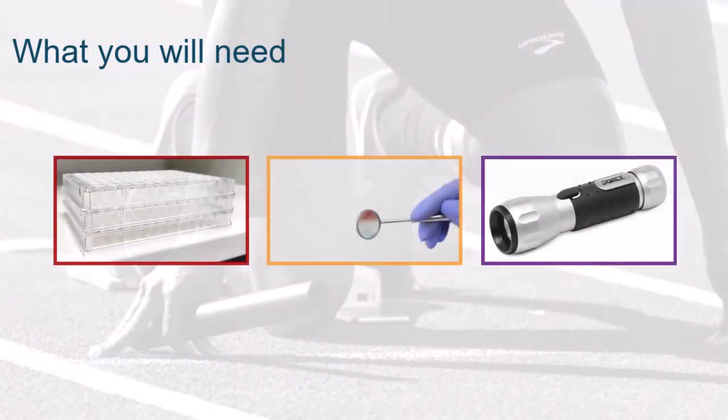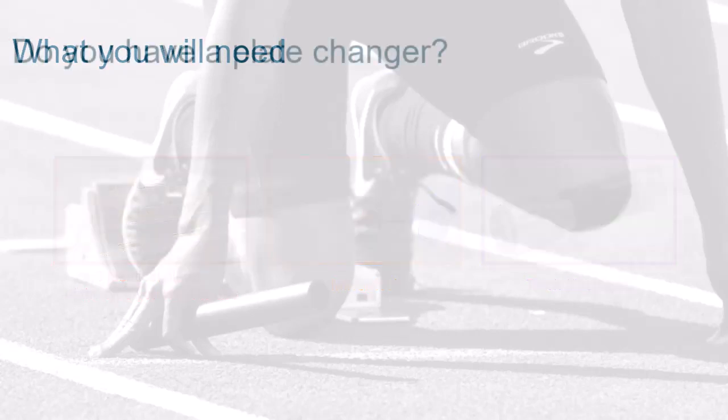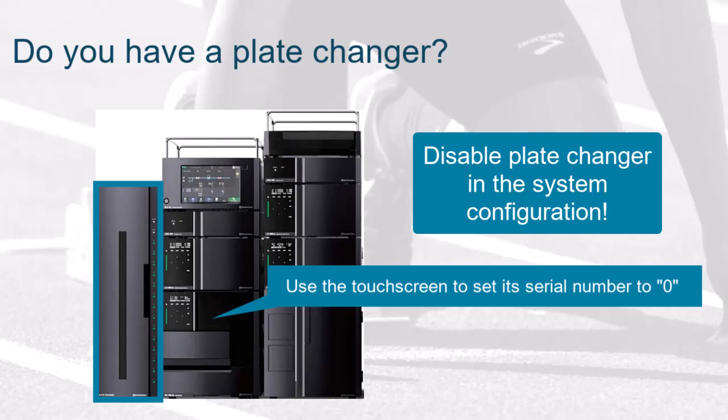Before starting the plate calibration procedure, make sure you have the following tools and items ready. You need to have three identical plates of the same type that you wish to use in the future. A mirror tool and a torch are also useful. If your system contains a plate changer, you must first disable it in the system configuration by setting the serial number to zero.